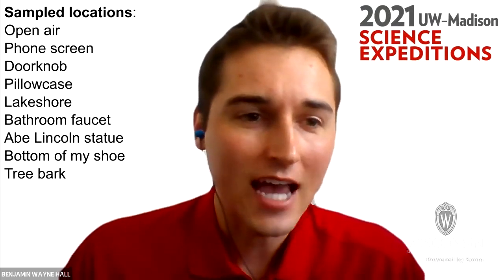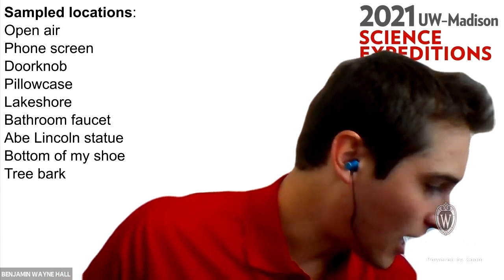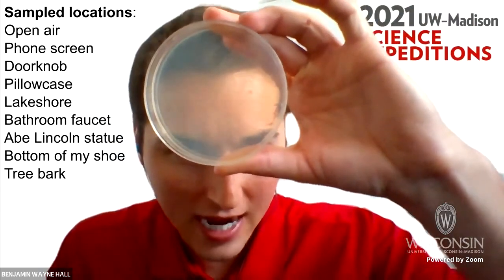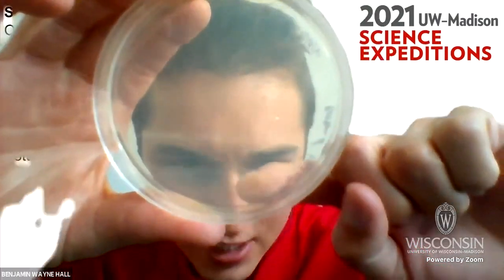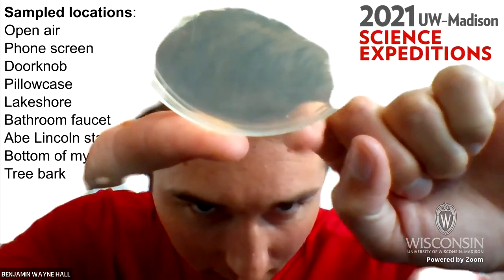So now I'm going to have us look at some of the other samples that people didn't mention. So first, I'm going to show us the bathroom faucet sample. And again, with this one, I did not notice many colonies on here. There is one tiny one where I'm pointing with my finger.